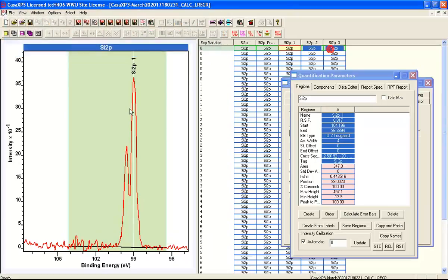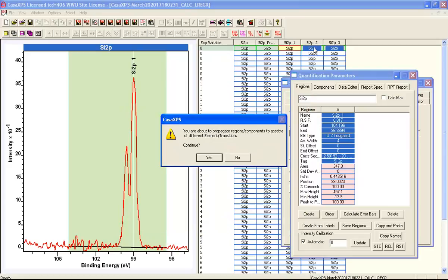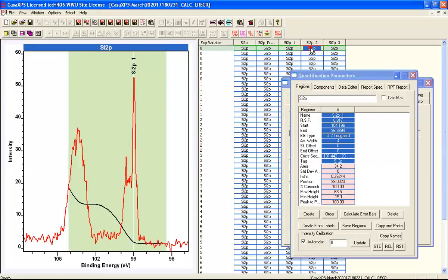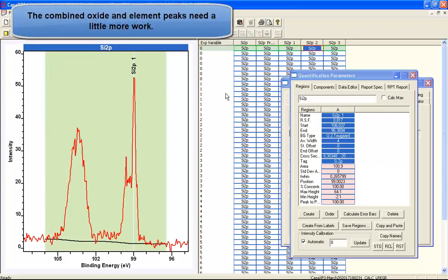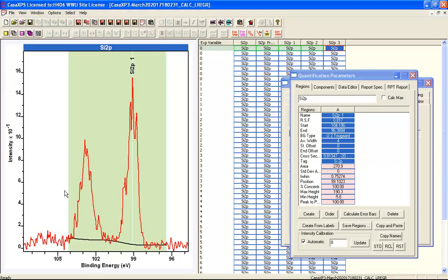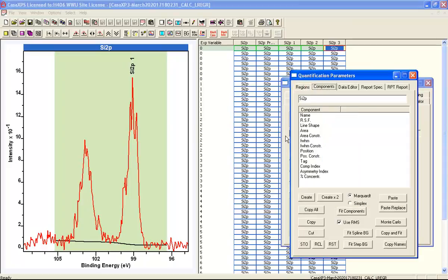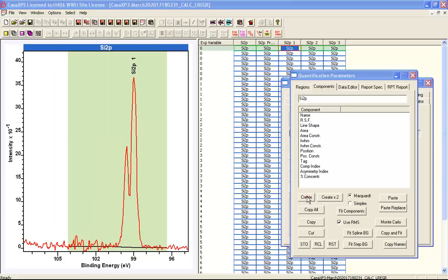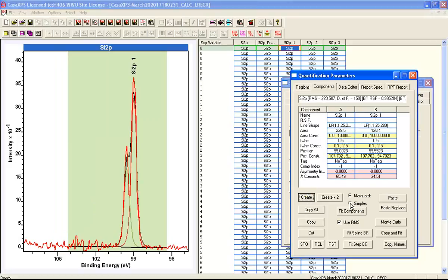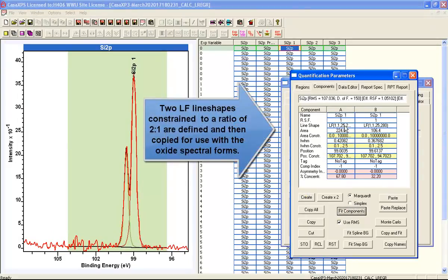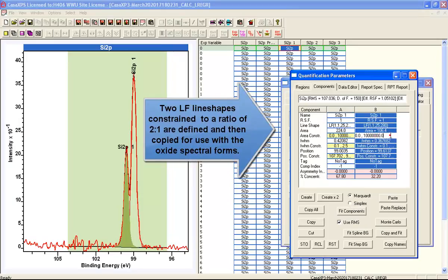Having propagated the background to the other two component spectra, we'll create silicon 2P doublets that apply to these individual components. We must have two doublets for each of the oxide and elemental forms that you can see, because we've got some elemental we must accommodate that also. We first create a simple peak model for the elemental form from the first component — just two peaks in the ratio 2:1. We say fit, and then use this as an estimate of what the offset and the full-width half maximum might need to be for these silicon 2P peaks.